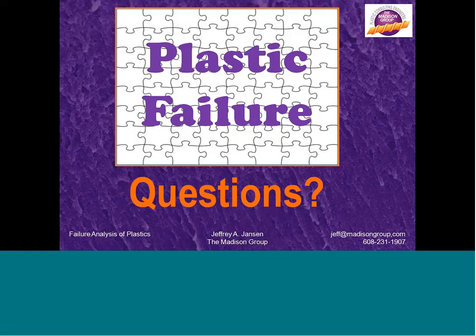Sure. If I've got a failed plastic part, I'm always going to look at it visually, and I'm going to look at it with a microscope up to 200x. If from there I feel I have my answer, if I've got a fracture and I understand where it's coming from, where it's going, and the mechanism of the failure, I may or may not do scanning electron microscopy. Other visual techniques I sometimes do are mounting and polishing cross sections. Very underutilized, but a very powerful technique for plastic components. Those are my suite of visual and microscopic examinations, but I'm always going to look at the part and do some type of microscopic examination.